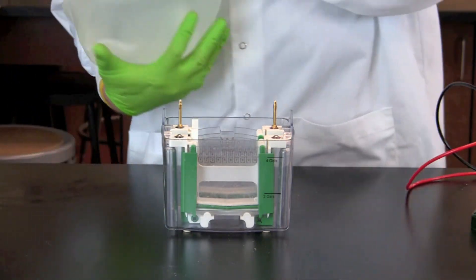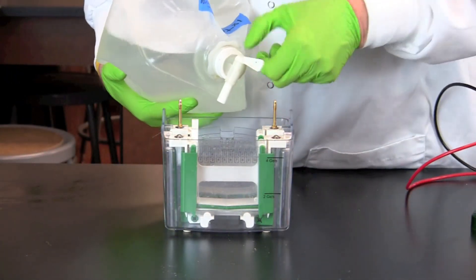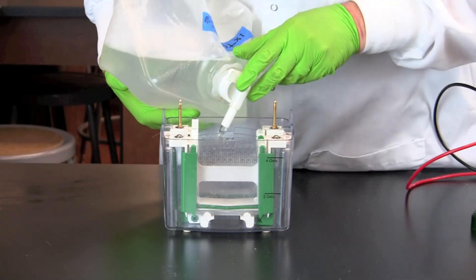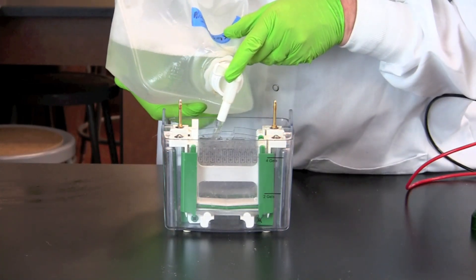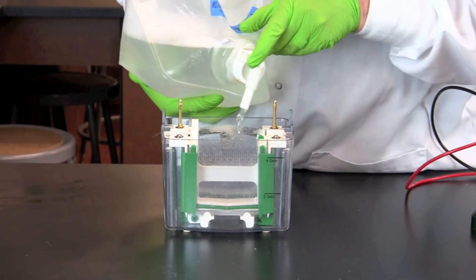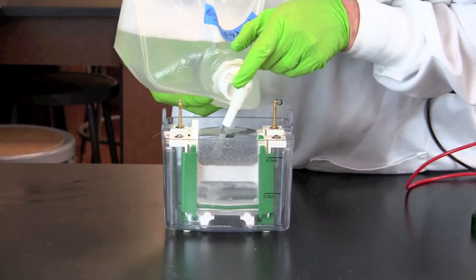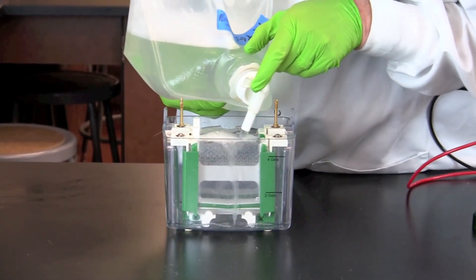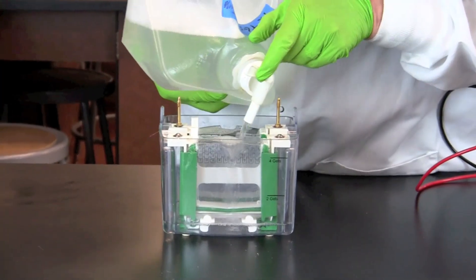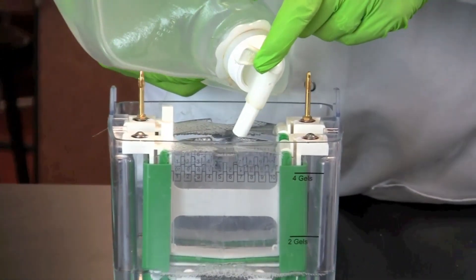Fill the chamber of the electrode assembly with 1X TGS electrophoresis buffer so the short plates of the gel are covered. Add buffer to the outer tank up to the four gels line.